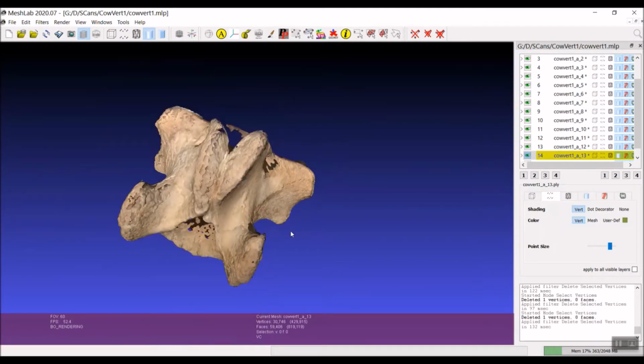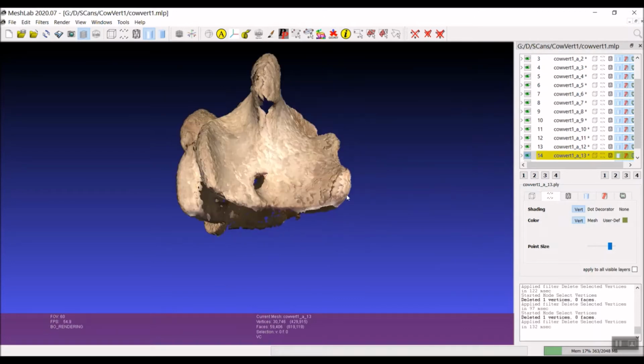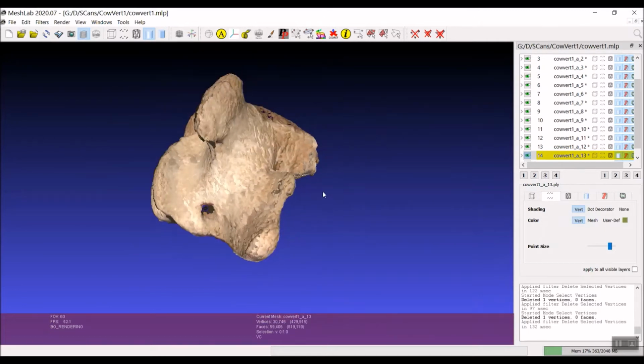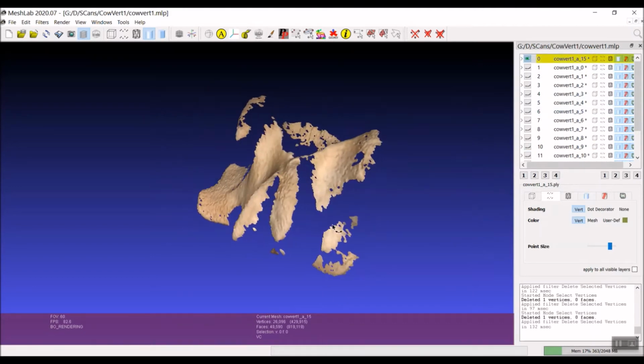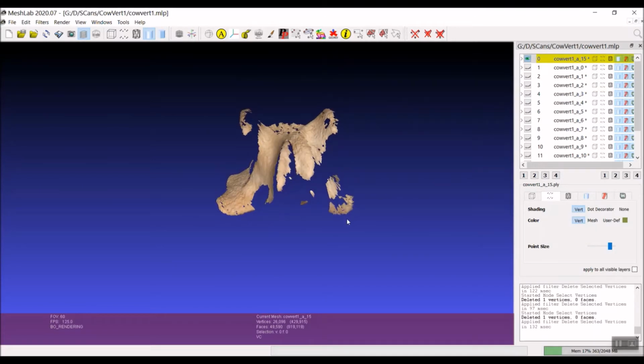Taking a look at this, we have a few holes and we don't have a whole lot of ugliness, but I'm going to show you how to edit single layers if you want, and then to remove some of the ugly colors. If you hold the shift key, then you can adjust visibility for all of the layers. So I'm going to hold shift and click on one of these eyes to make them all invisible. And then I can look at each one at a time. And if you see some stuff that you want to remove, there's a couple ways to do that.